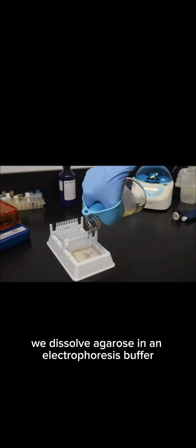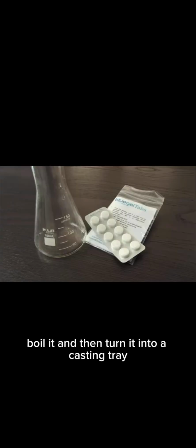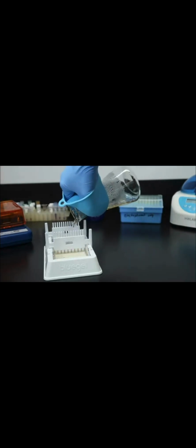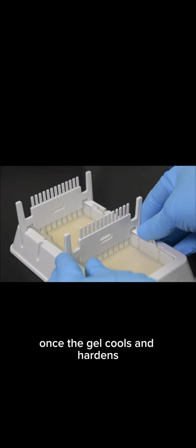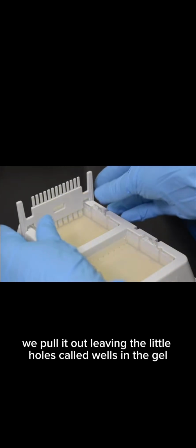In creating agarose gel, we dissolve agarose in an electrophoresis buffer, boil it, and then pour it into a casting tray. Then we place a comb at one end of the gel. Once the gel cools and hardens, we pull the comb out, leaving the little holes called wells in the gel.